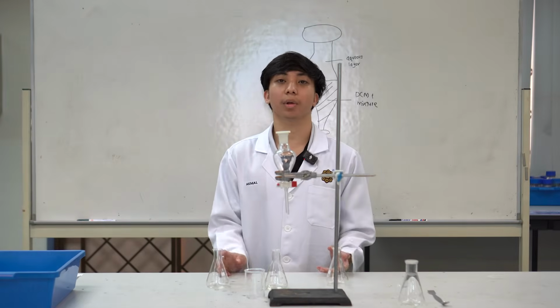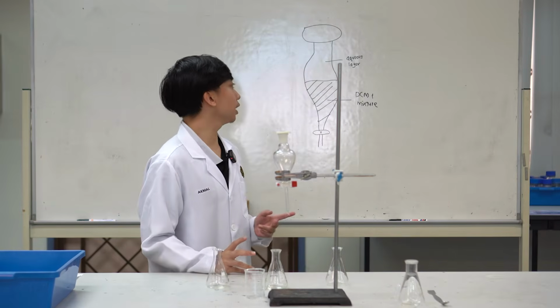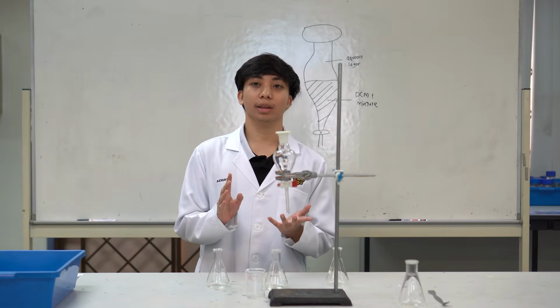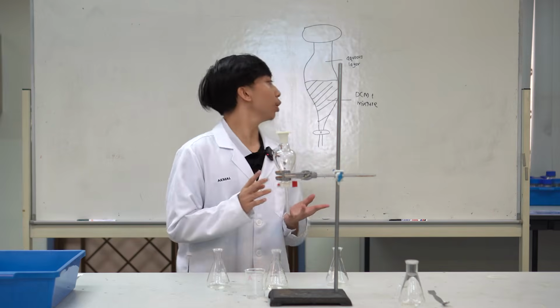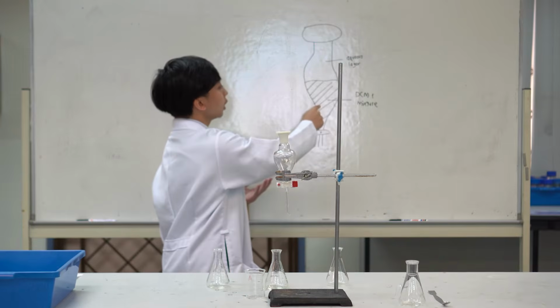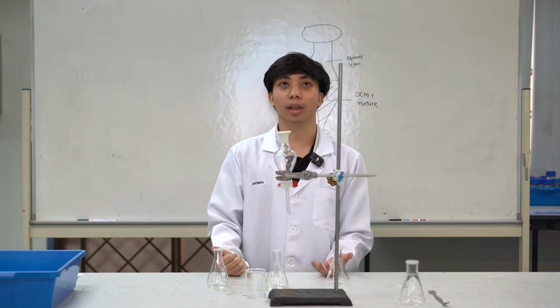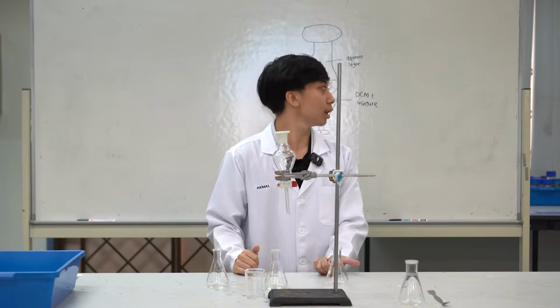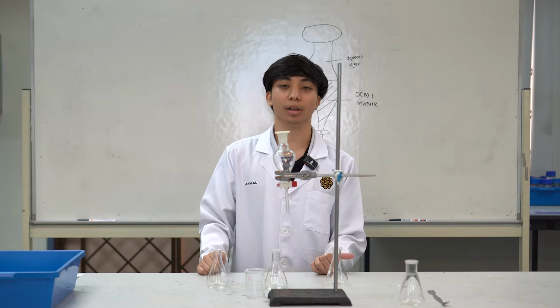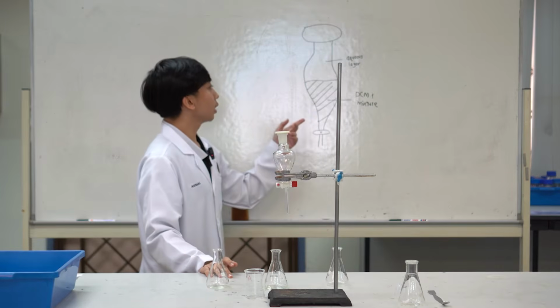So I will continue about the result and application. So as we know, the acidic compound will combine with base, so it will produce a water soluble salt, which is why we need water, so the soluble salt will dissolve in this water, and the rest will remain as a mixture. And then as we know, acidic will react with base and basic will react with acid. Both can produce water soluble salt, and the neutral will stay in the mixture unreacted.